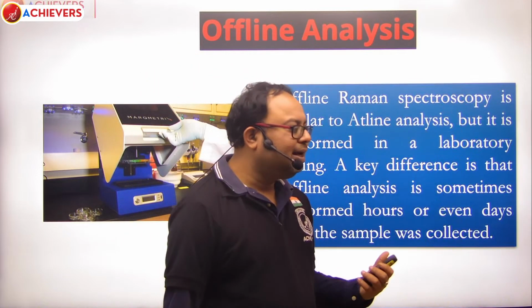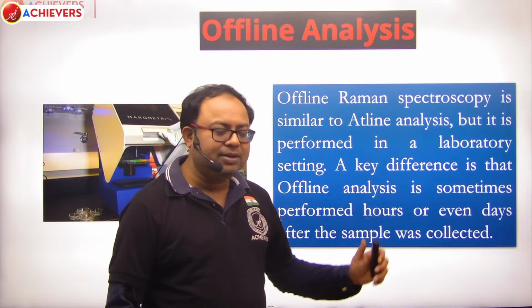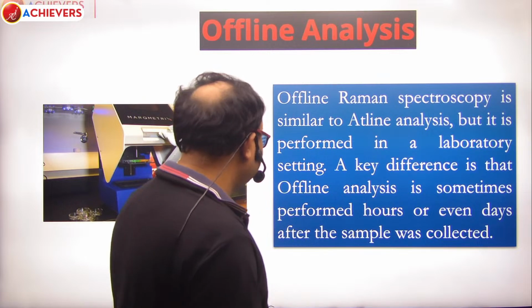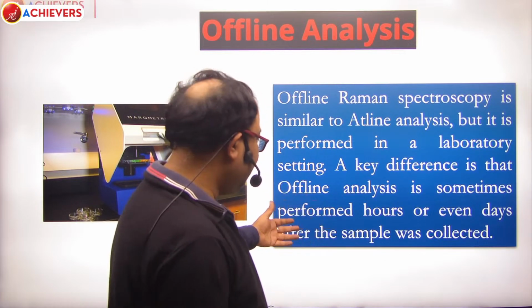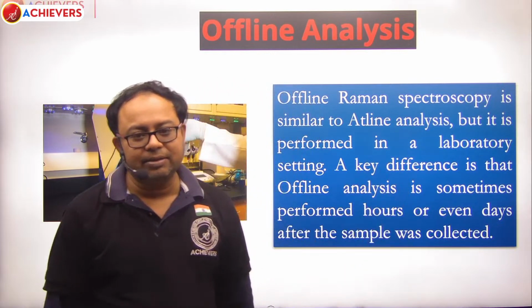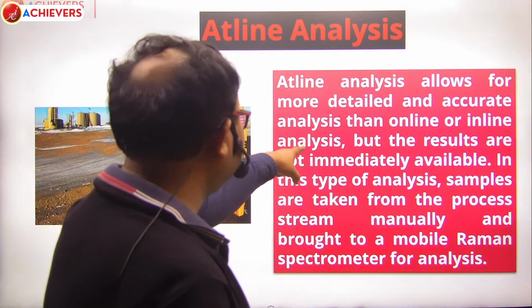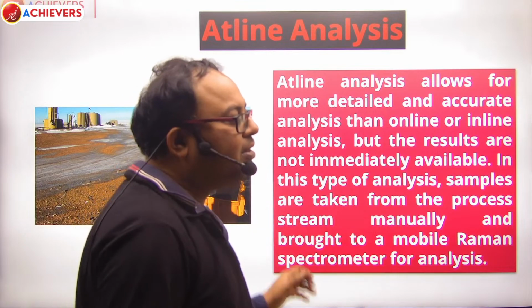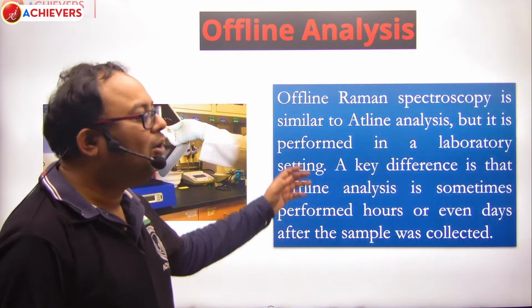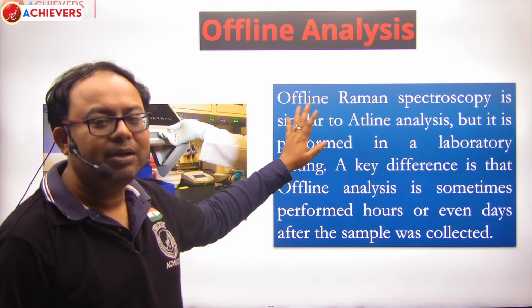I mean to say this is obviously a difference, because it is performed in a laboratory setting and some hours, even days, are taken after the sample was collected. That's a difference, obviously, but again there is a subtle similarity over here. As I've already told, in at-line analysis the results are not immediately available. This is a very time consuming process. Similarly, offline analysis is also very much time consuming.